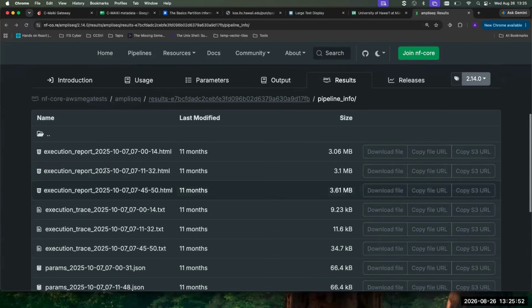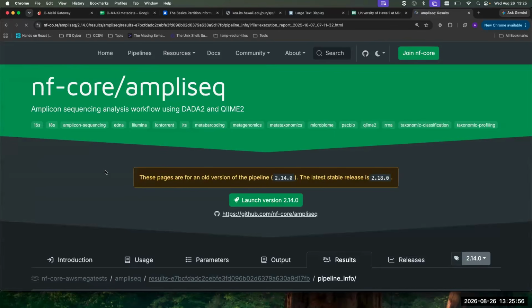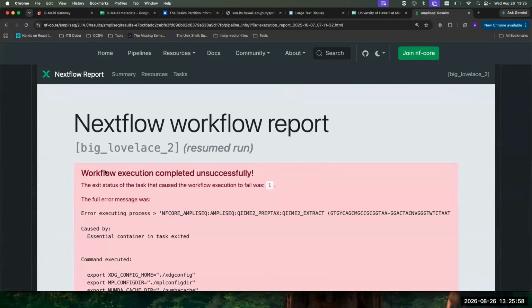Okay, I'm not sure which one of these, but one of them essentially has a paragraph that you can paste into your paper that is the method section, and it tells you in English with all the references that you need, what database you used and the reference for that database, and how you ran it and what your trimming parameters were, so that you can essentially move that into a paper.